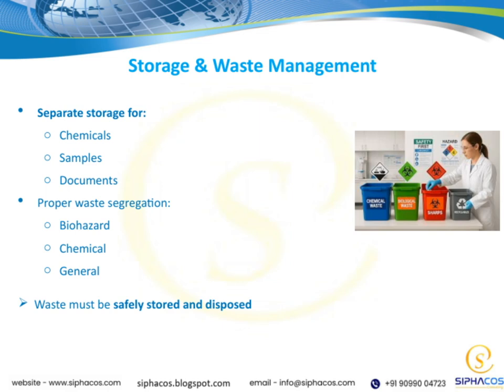Remember, all waste must be stored securely and disposed of safely, following the correct procedures. This not only protects us, but also maintains a safe environment for everyone involved. Keeping these practices in mind is key to maintaining compliance and safeguarding health in our workspace.